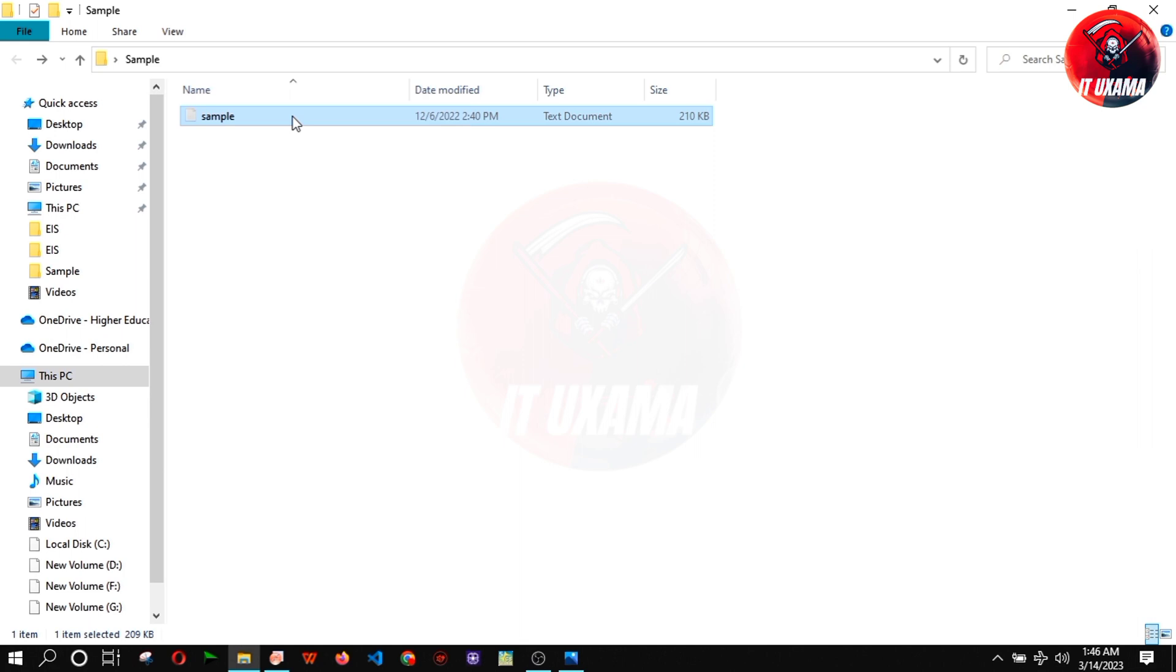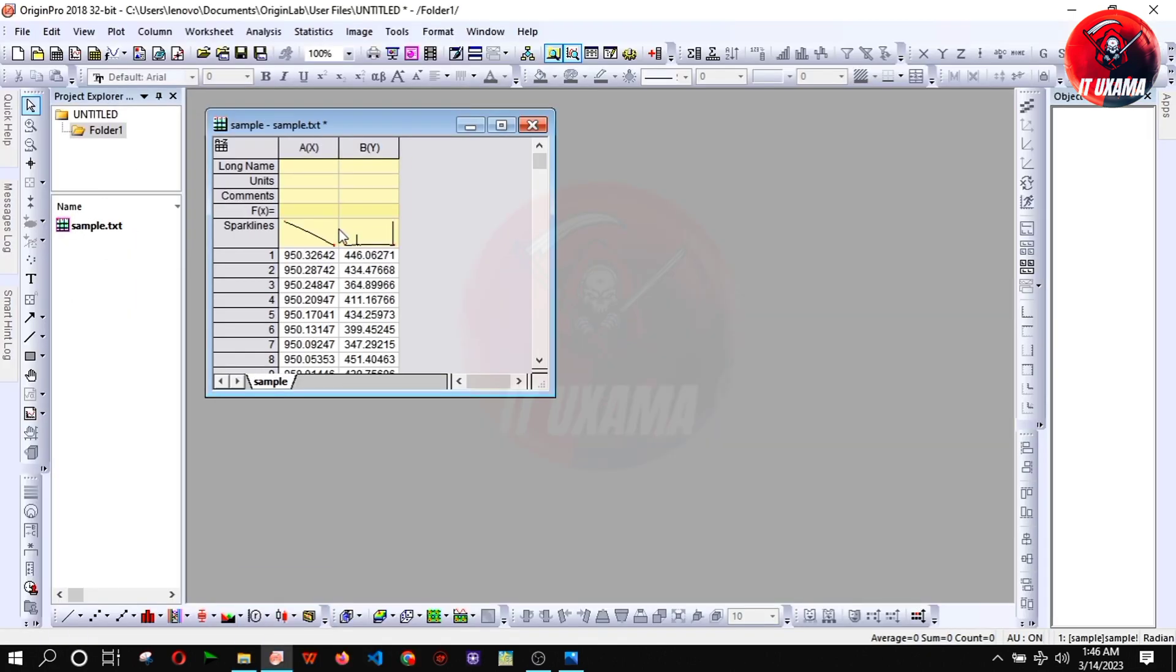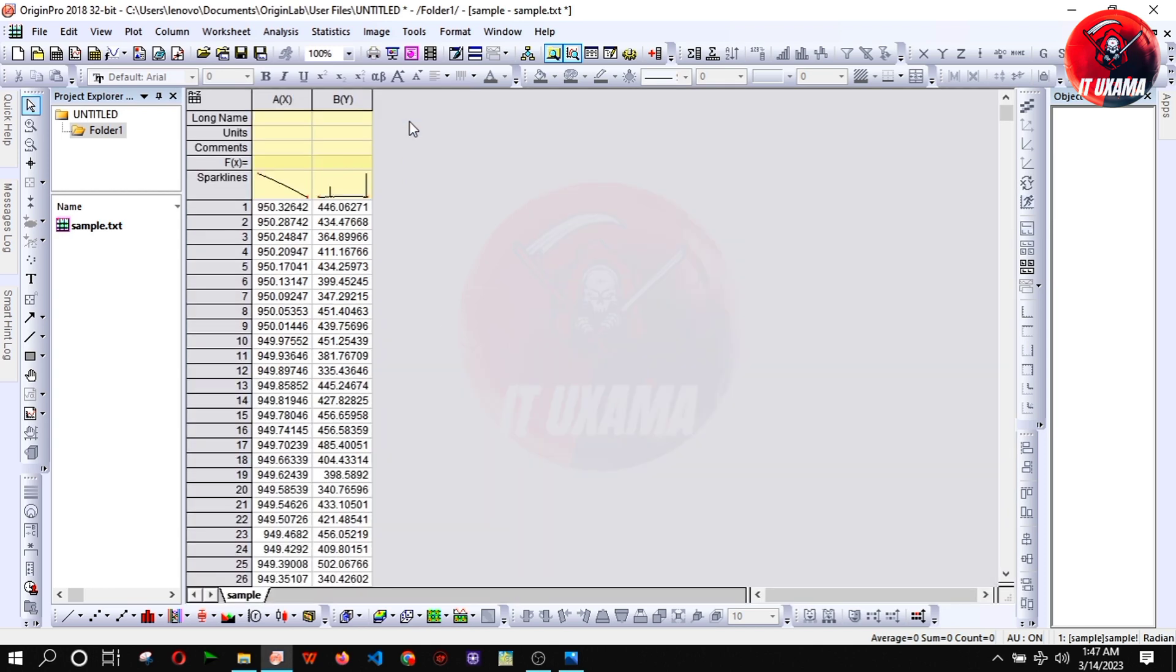You have to drag and drop your sample data of any format into Origin Book. This is Photoluminescent Spectra of Graphene Oxide. I'm using Origin Pro 2018.